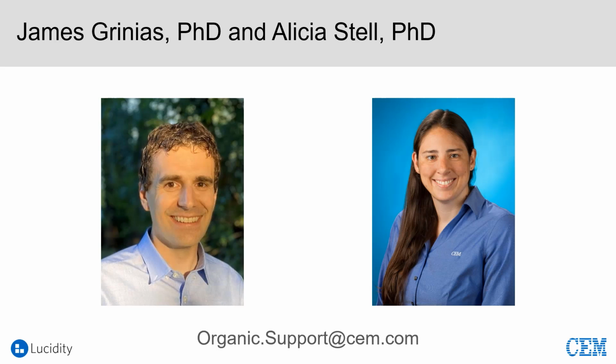Well, I think that there are a lot of different sort of integrated small form factor LCs that are coming out. And that's part of the reason I've been excited about the system. It's a general area that I'm really interested in, and I think one thing is what is the general column scale. So some of the instruments that are coming out do have lower flow ranges. There might be some green analytical chemistry advantages there, but I think speaking about the miniLC in particular, I think the biggest advantage is, again, the small form factor that also is readily adaptable to a lot of existing instrumentation that's out there in terms of method transfer.